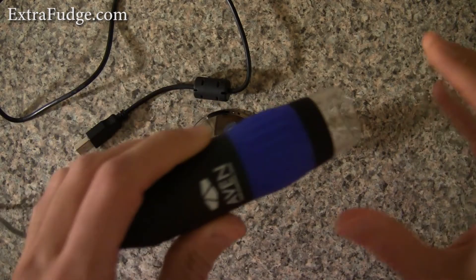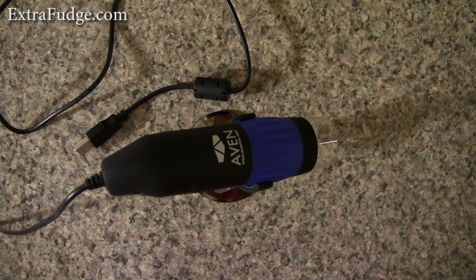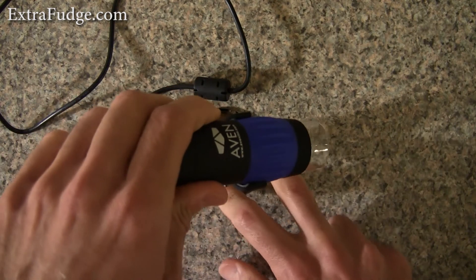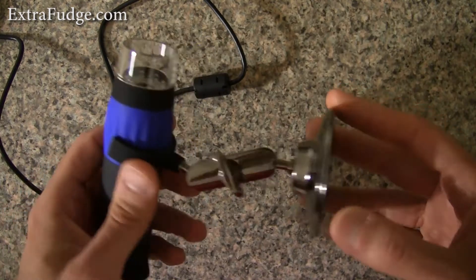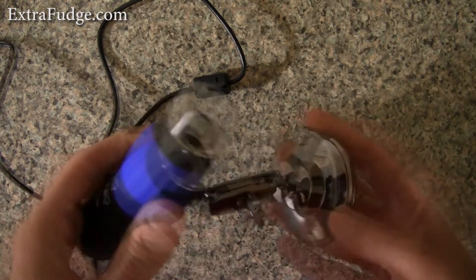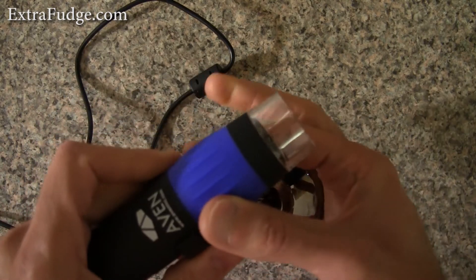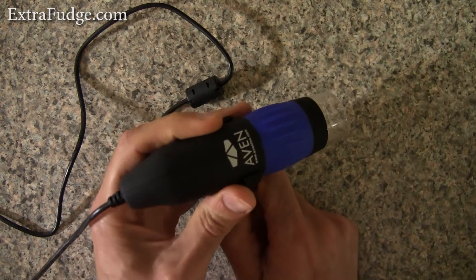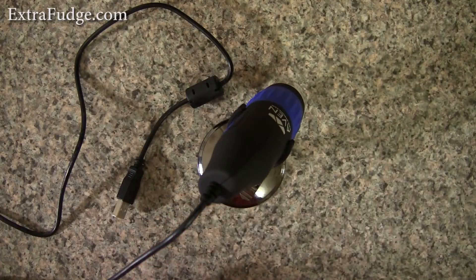Let me talk about what I did like about this device. I found that the photo quality was decent for the price, and I think the construction and build quality is pretty good. The stand — while people on Amazon weren't loving it — I think is very reasonable for what we pay. It's a nice stand, though it doesn't work well because any movement to the ring moves everything out of position. If everything were done electronically, it would be a really good stand.